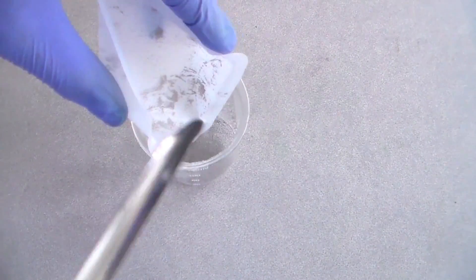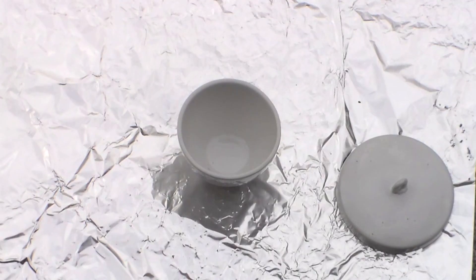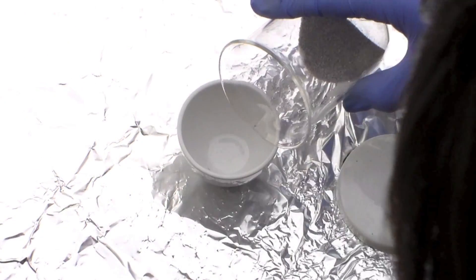Once I had measured everything out, the chemicals were added to a beaker and mixed using a glass stir rod. Once the powders were mixed, I transferred them to a crucible.